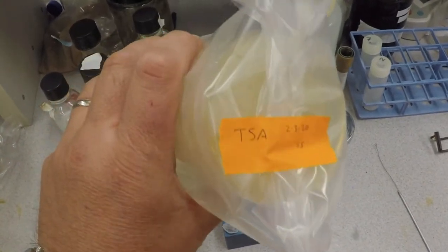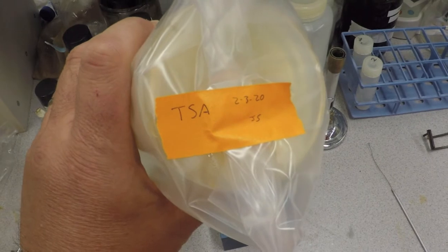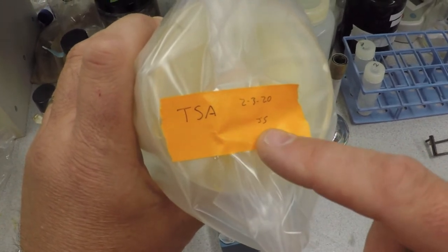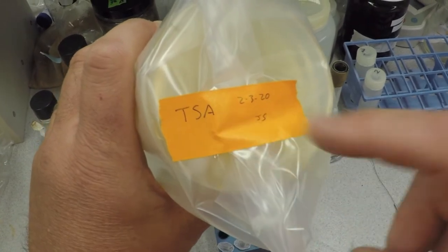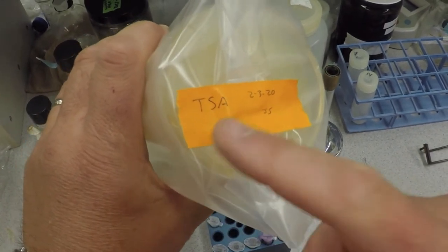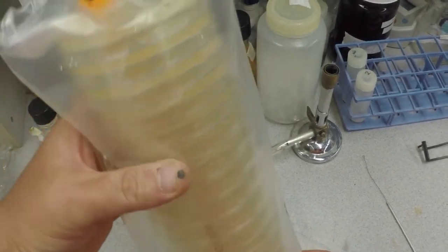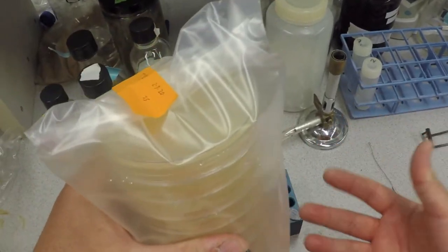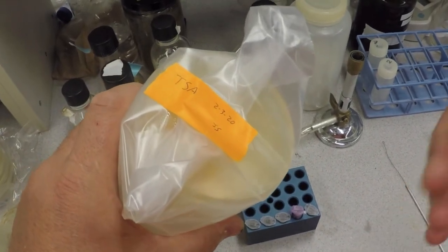This is, I hope you can see, tryptic soy agar, TSA. Notice the person has put down their initials and also the date that they made these plates and poured them, which is very important. Tryptic soy agar is really simple—it's called complex agar, but it's a simple formula.